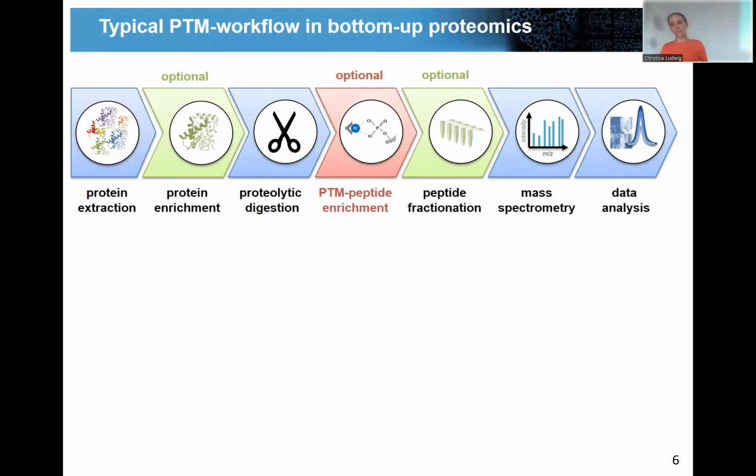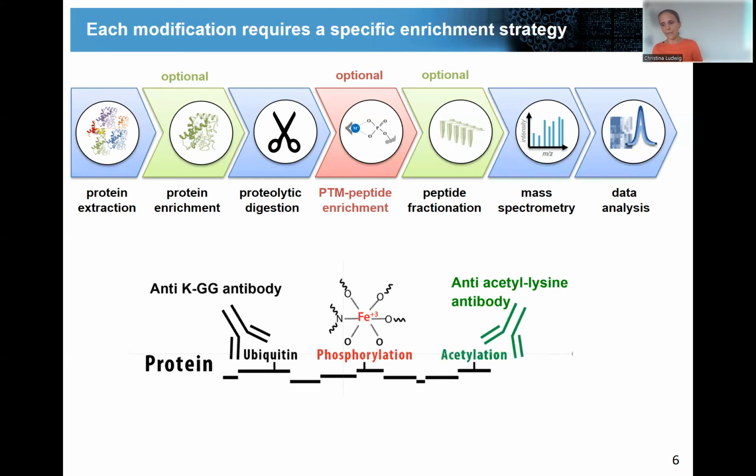Okay, then we have this PTM enrichment step, which is, of course, again, something that is very specific for PTMs. And this is also often a game-changing step in the project, because if you have a well-working PTM enrichment procedure, this can really drive a project. It can be very positive for a project, or can make your ability to detect these PTMs increase a lot.